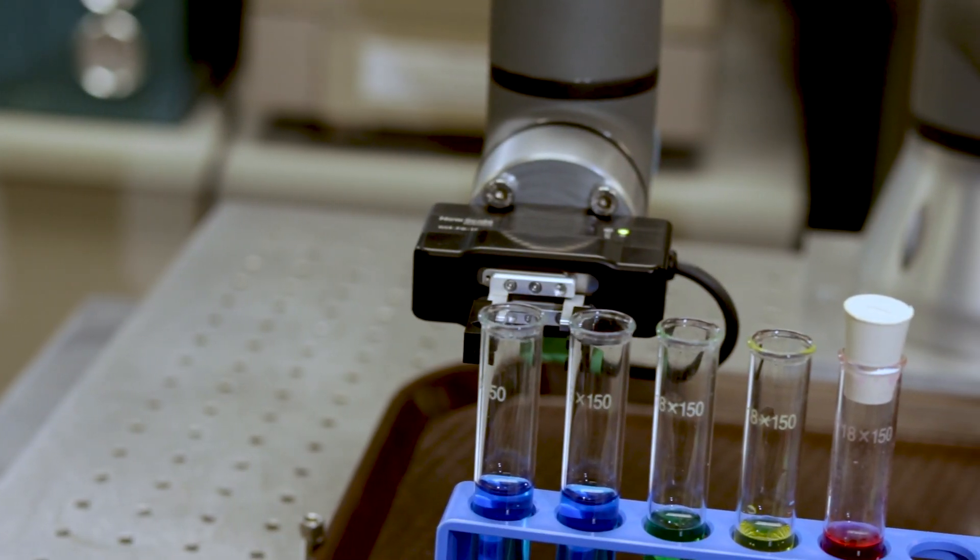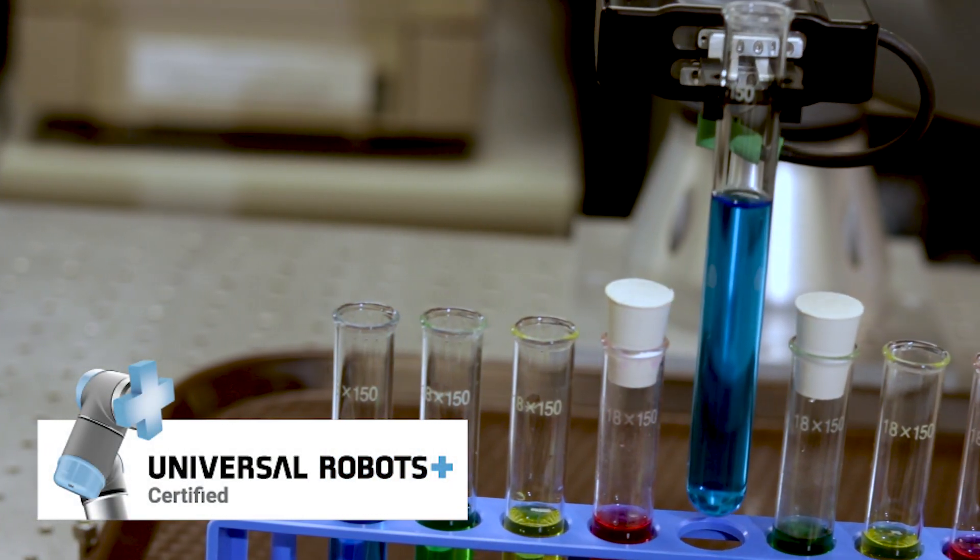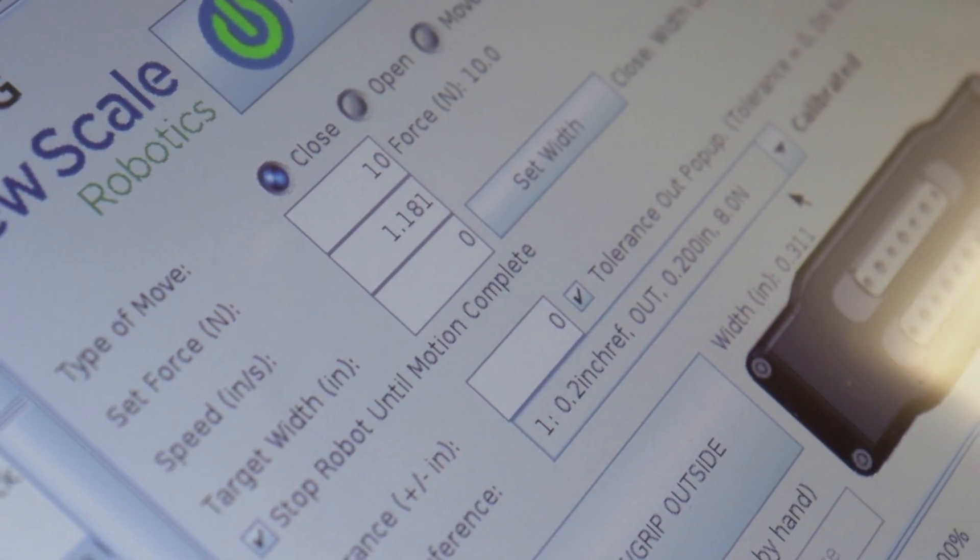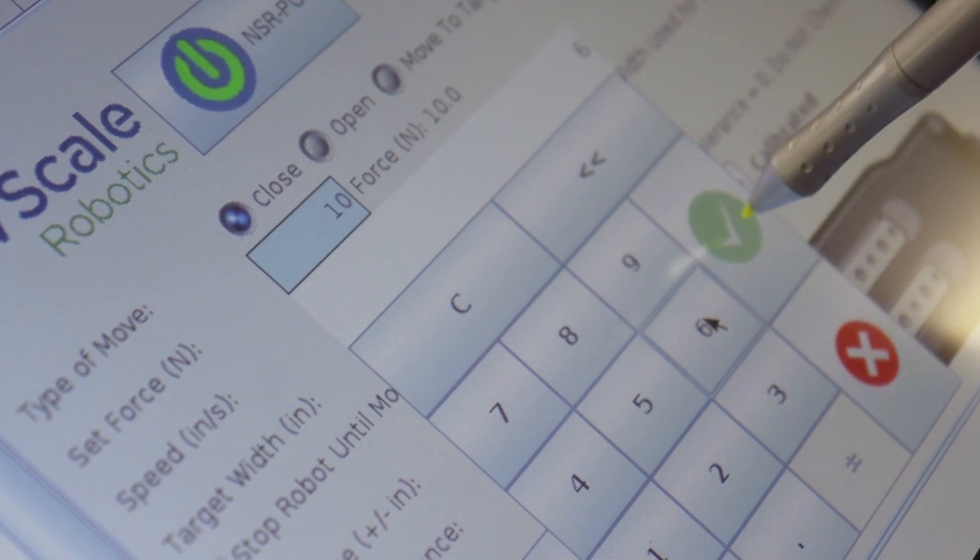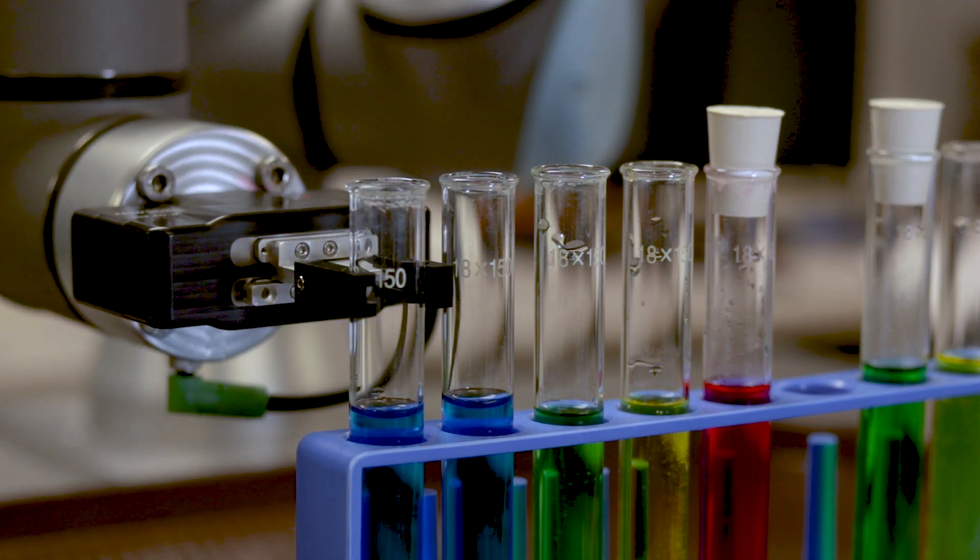The NSRPG carries a UR Plus certification and is currently the most precise gripper available on the platform. This level of precision allows for a high level of care. You can choose precisely how hard or soft the gripper will handle your workpieces, ensuring the safest handling of delicate items.